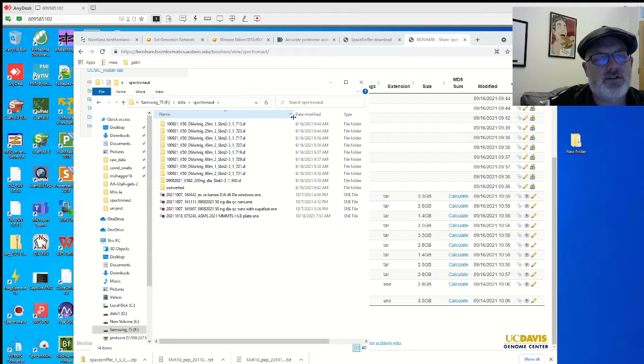Unfortunately, you can't just download it from their website. But if we've given you data in Spectronaut, email me, or I usually email you or someone in the core and give you instructions on how to download the viewer. If you don't have data from me, I think you can ask them. I don't know, they're very nice. You can ask for a viewer to open this if you want.